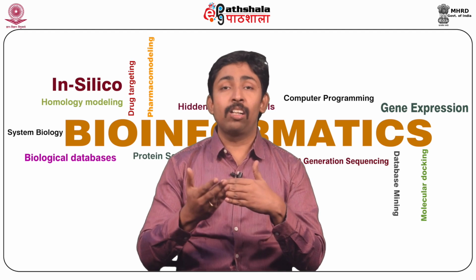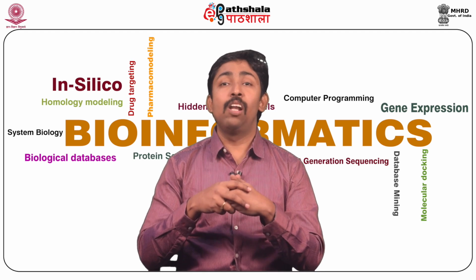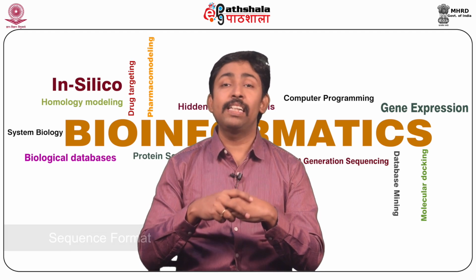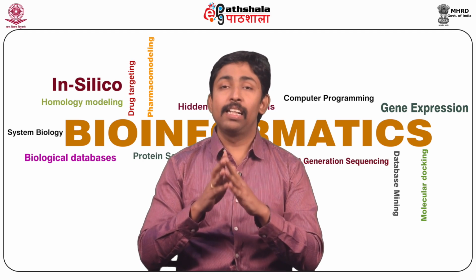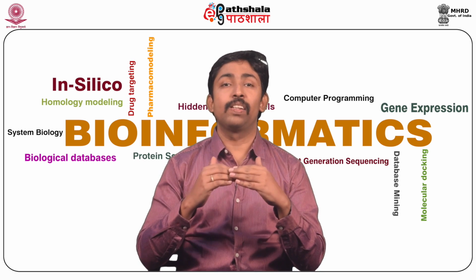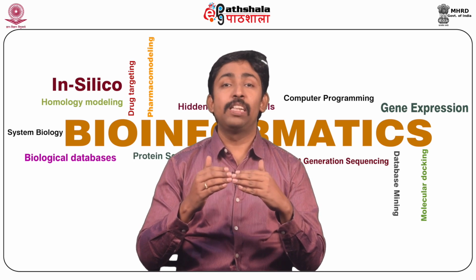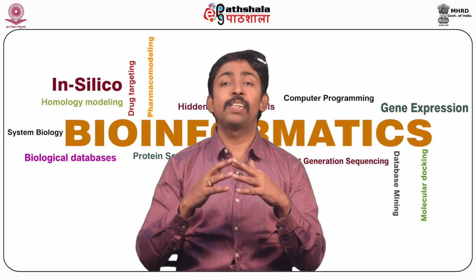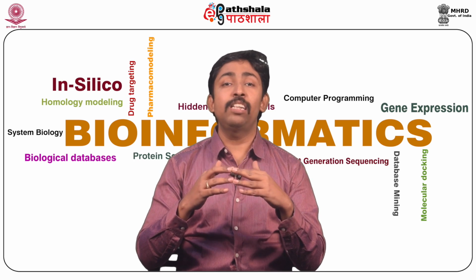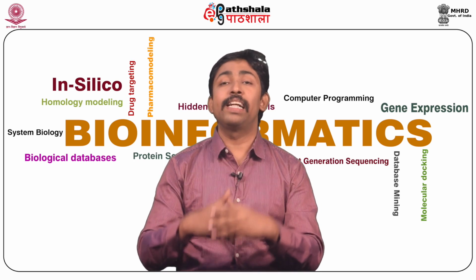The second argument that we have to supply to a BioPython parser is a lowercase string specifying the sequence format. You have to say in what format you need to parse your sequence data. There is also an optional argument, alphabet, to specify the alphabet to be used. This is useful for file formats like FASTA, where otherwise Bio.SeqIO by default will use a generic alphabet.